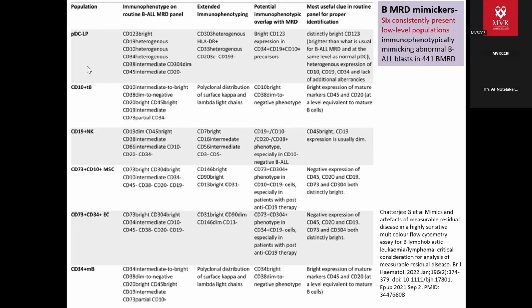The only difference in this plot is that the first plot is time versus forward scatter. The events acquired are 64 lakhs, that is 6 million events. These have been acquired in 4 batches. 4 times I've aspirated, each aspiration around 16 lakhs. So I've merged the data and taken out 64 lakhs of cells.